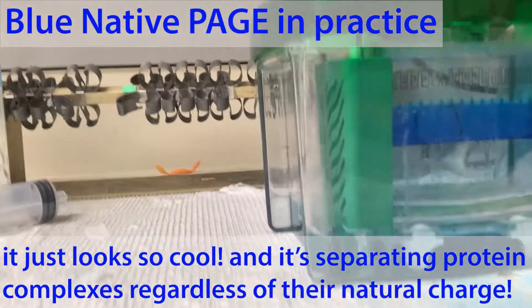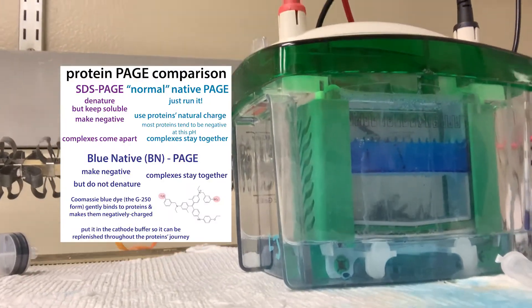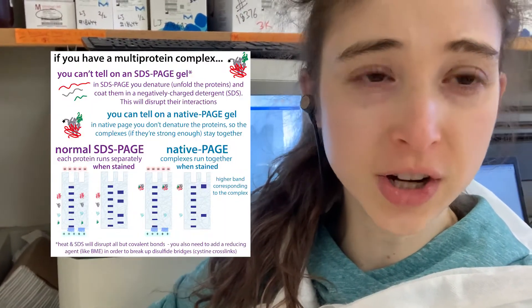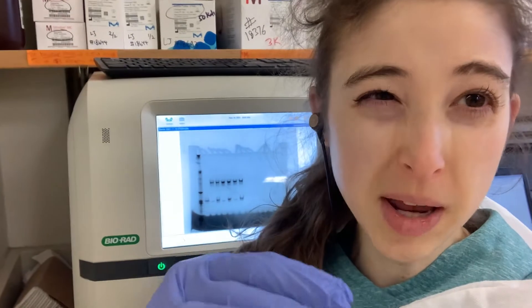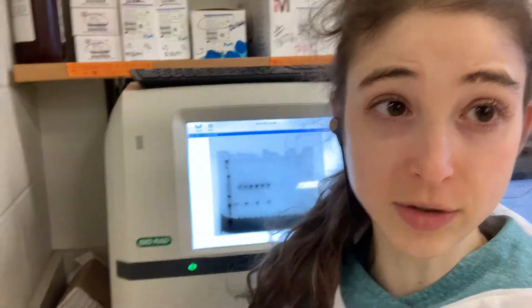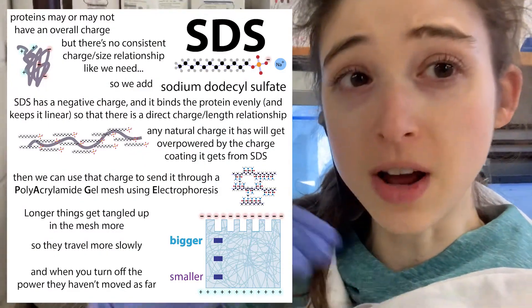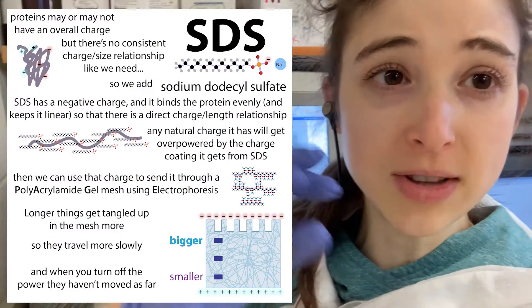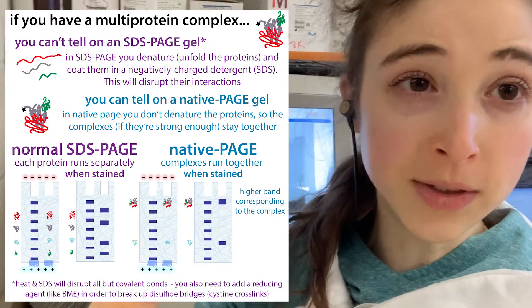It just looks so cool - it's like somewhere in there is my protein. Yesterday I told you about Native PAGE, in which we separate protein complexes together through a gel. It's like SDS-PAGE in that you're using a gel to separate proteins by their size using electricity to get them to move through the gel. But unlike SDS-PAGE, you're not unfolding the proteins, so this keeps complexes together so you can see if proteins are forming multimers and that sort of thing.